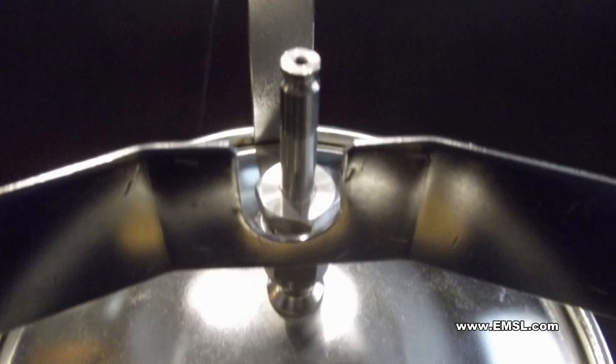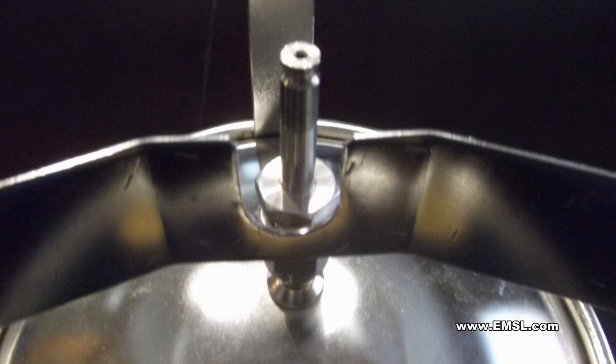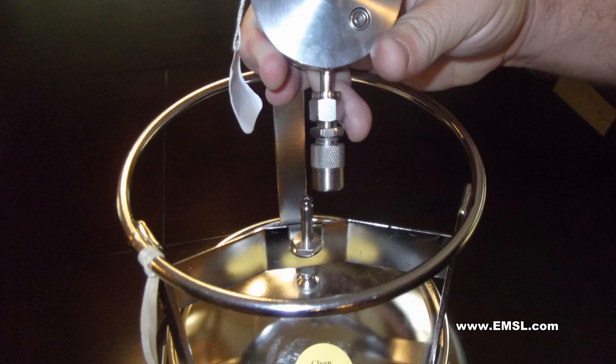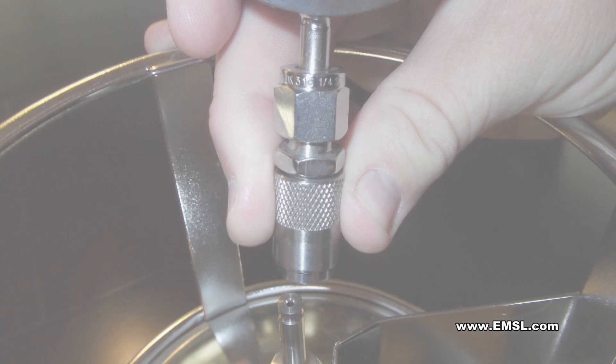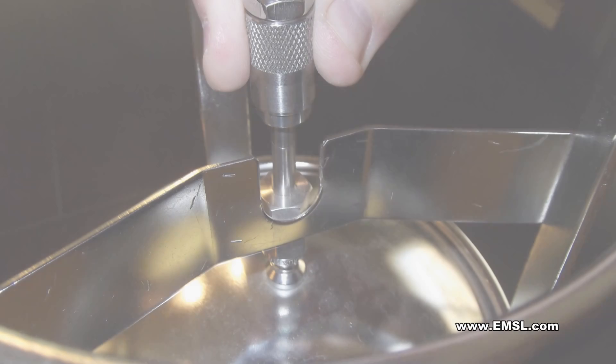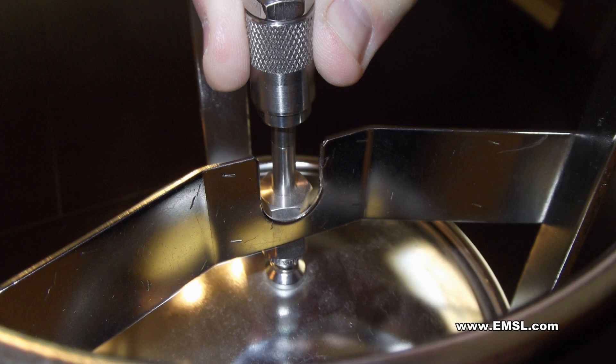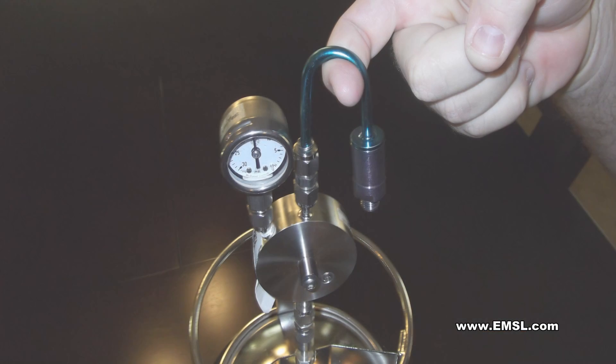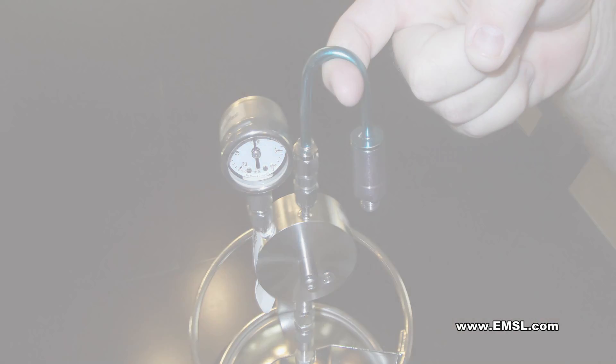Now attach the regulator to the canister by aligning the male QT valve stem, which is on the can, with the female QT valve body on the regulator. Pull back the sleeve on the QT valve and insert the stem onto the body on the canister. Release the sleeve and ensure that it returns to its normal position. Gently tug on the regulator to make sure the two parts are attached securely.